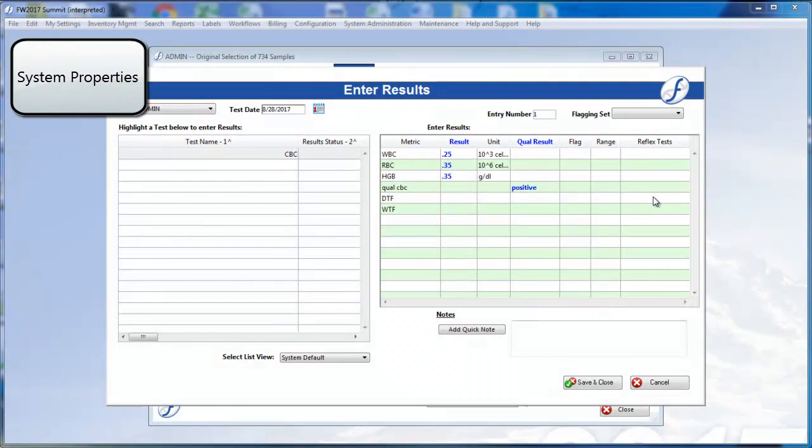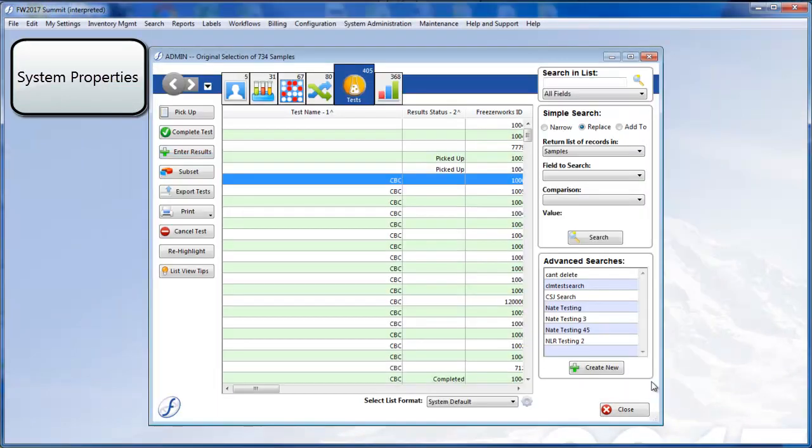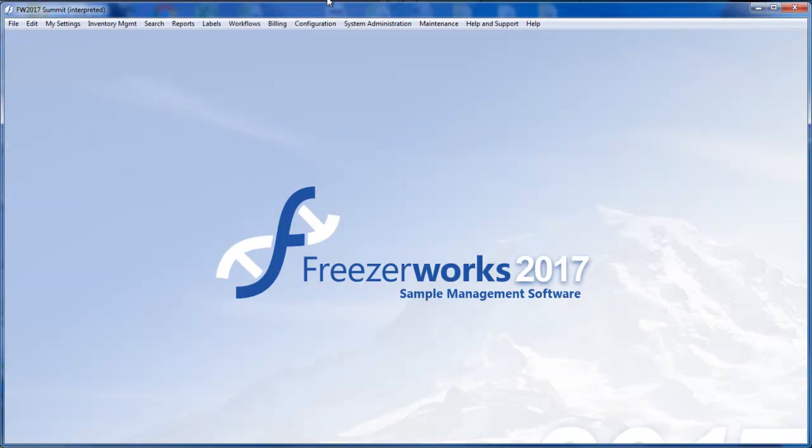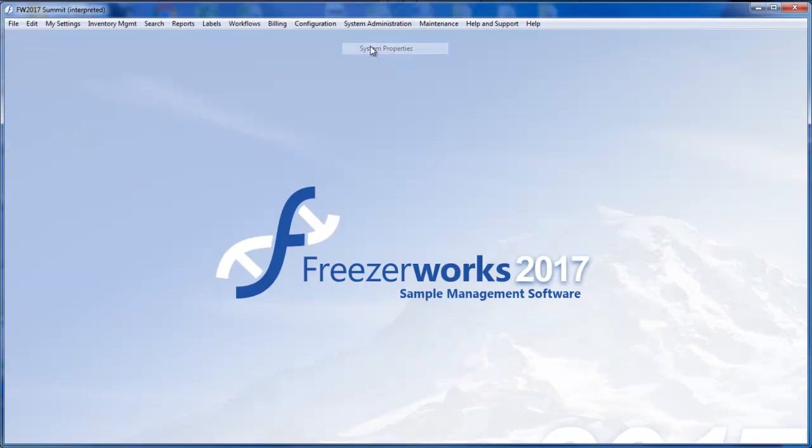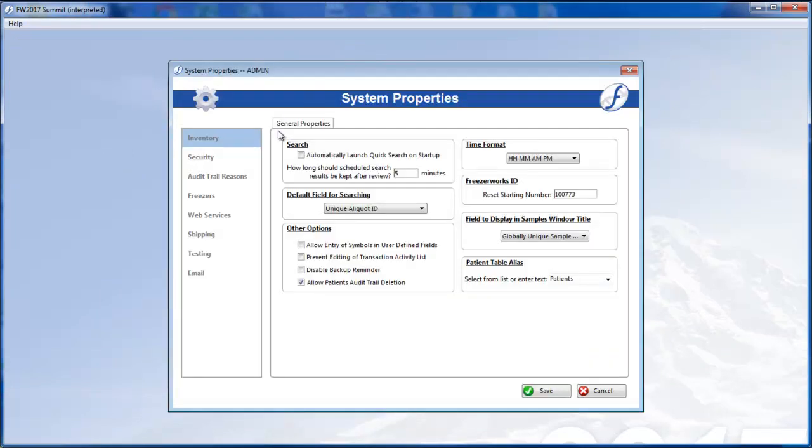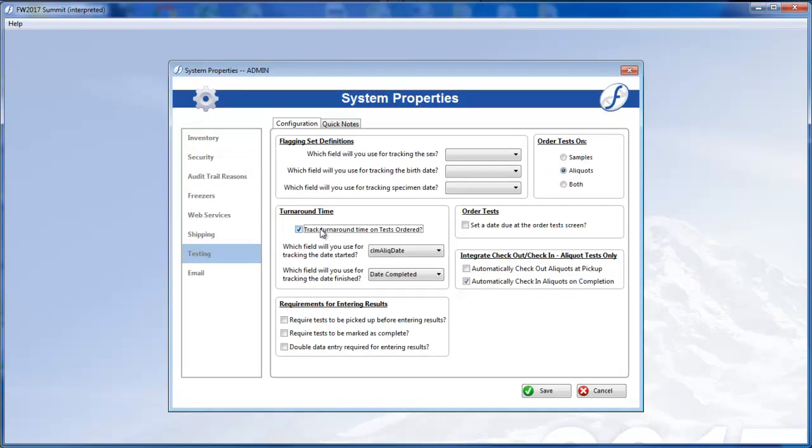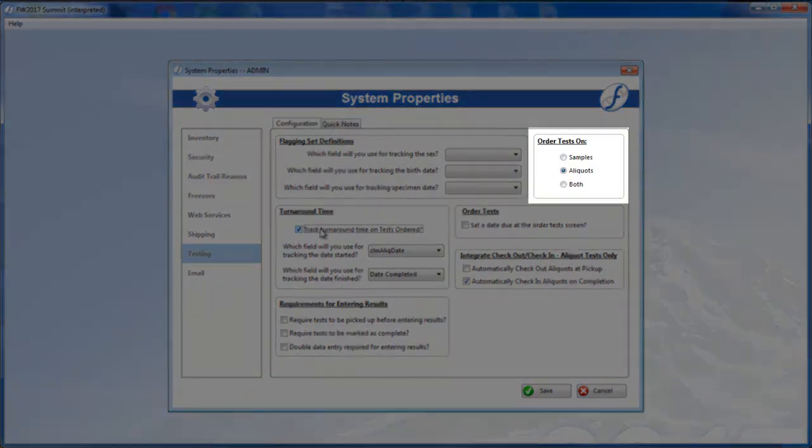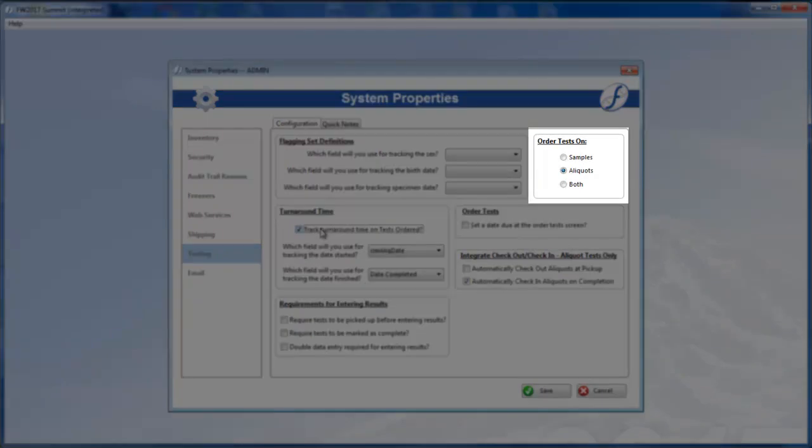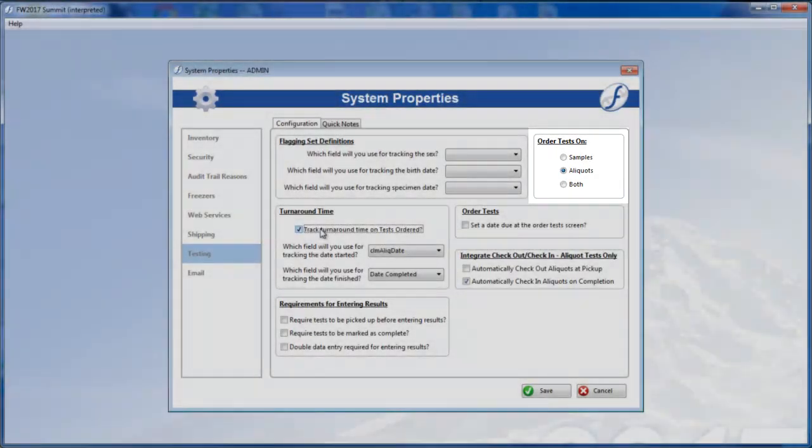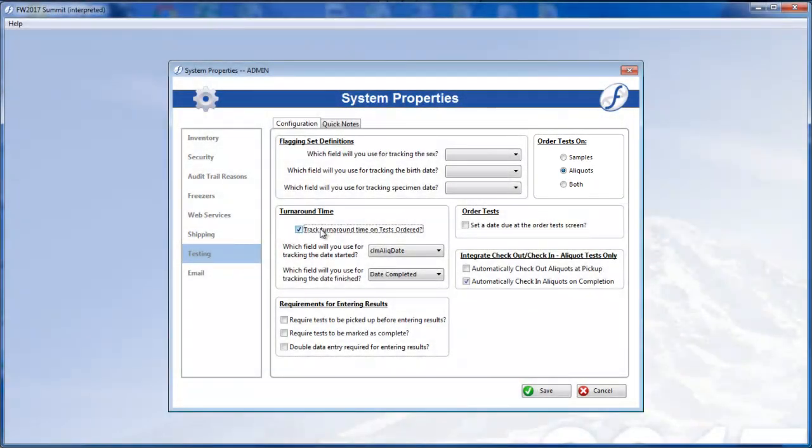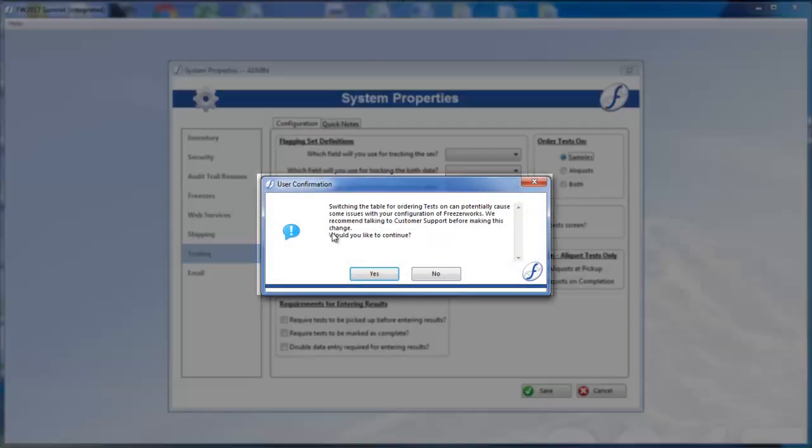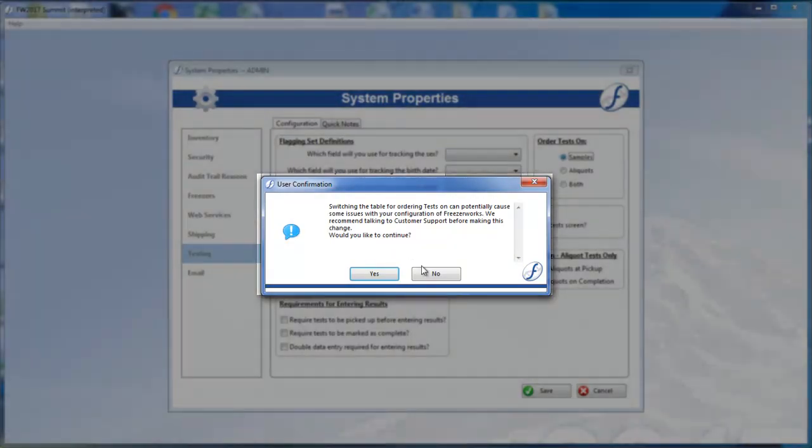The last thing we should quickly go over is the changes to the testing page and system properties. First of all, you no longer have to choose between ordering tests on samples or aliquots. You can select both if you wish. Just remember that changing the selection after tests have already been run can cause data integrity issues.